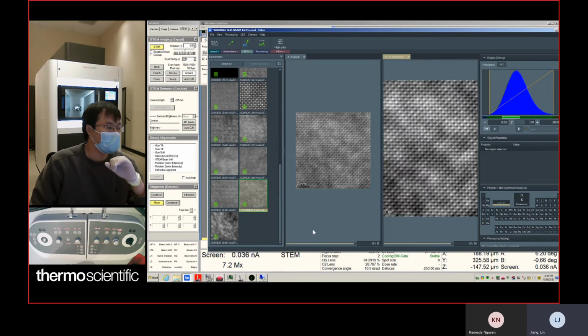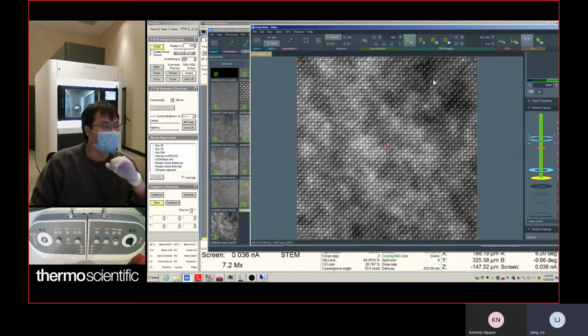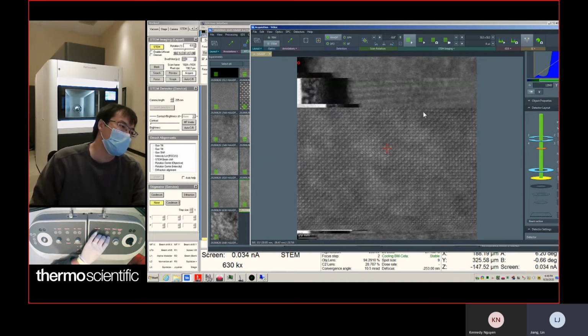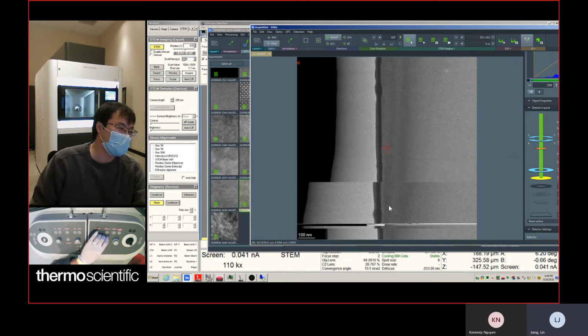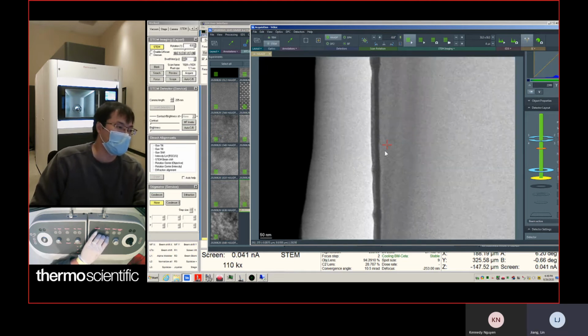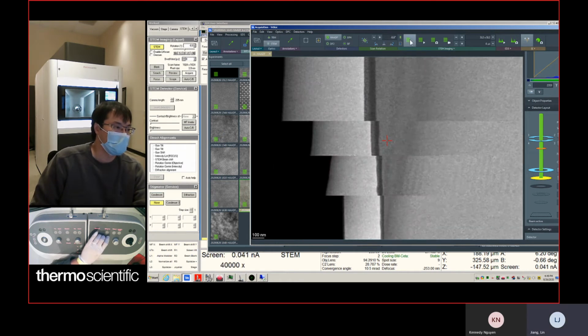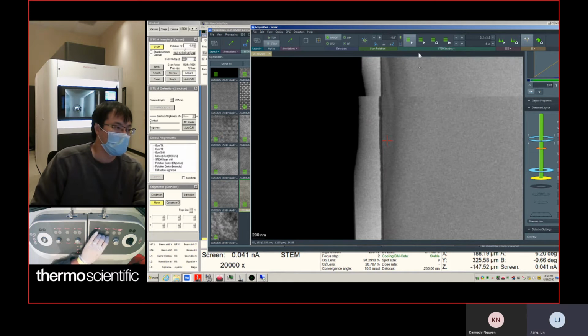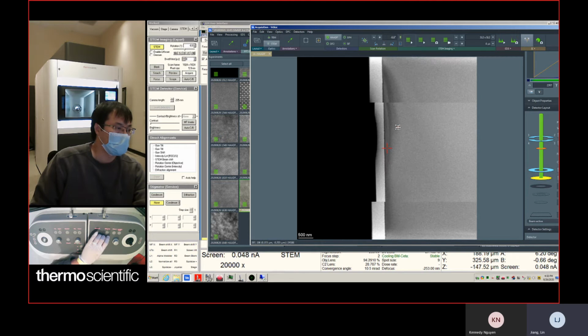Yeah, just simply it's not. This region is not properly on zone. This region is staying on, but it's got a lot of contamination. Probably I will say for this sample, somewhere around here, it's a better region. It's the best region to do imaging.